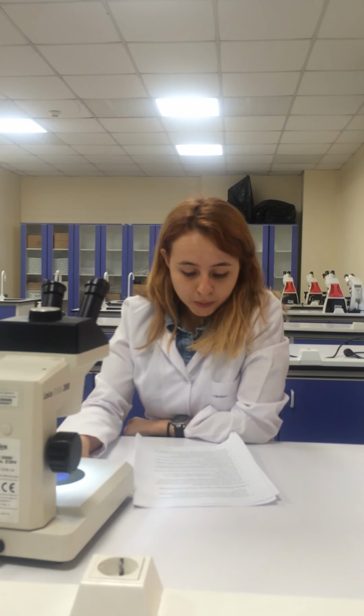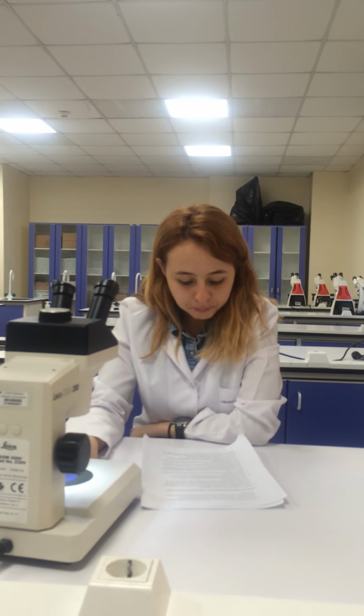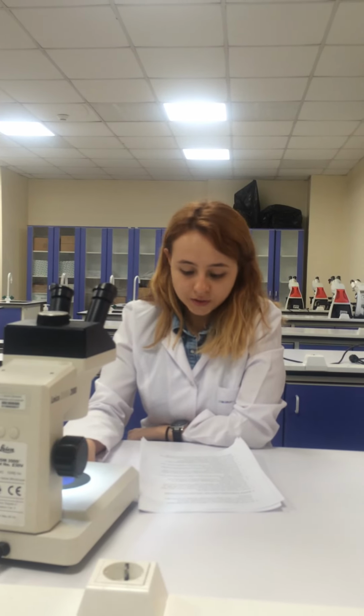After 2 washes, 100% propylene glycol is added to the culture plate and left for 1 minute. The 100% propylene glycol is removed and then oil red O solution is added to the culture plate. The solution is left for at least 10 minutes on a rocker shaker with gentle agitation at 100 RPM. The oil red O stain is removed and replaced with 60% propylene glycol. The solution is left for 1 minute at room temperature.